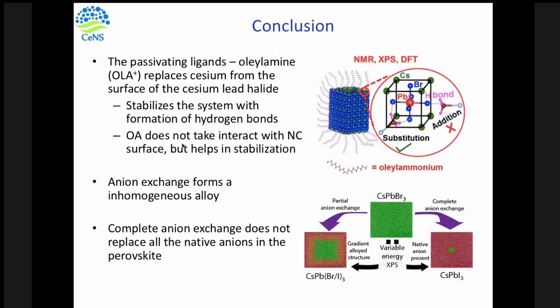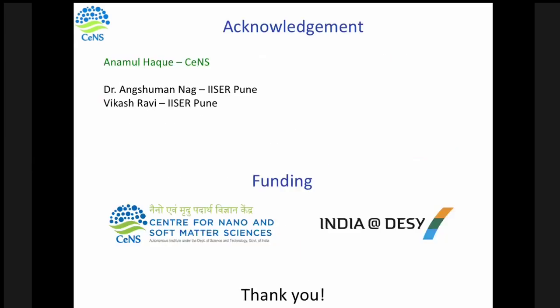So this is our understanding of this material, from the understanding of its internal heterostructure, and all this we have achieved from photoelectron spectroscopy. The conclusions we got from XPS are supported by other experiments like NMR and photoluminescence, etc. So I think here I'll conclude.